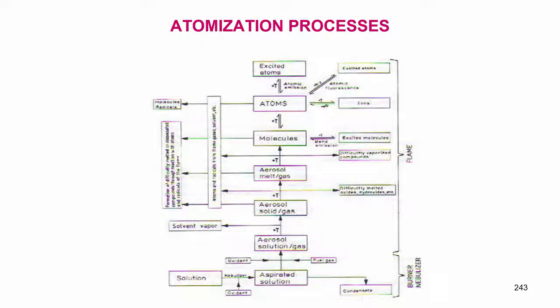Now we are going to discuss in a little more detail the atomization process. First we have the sample, that is the solution here.